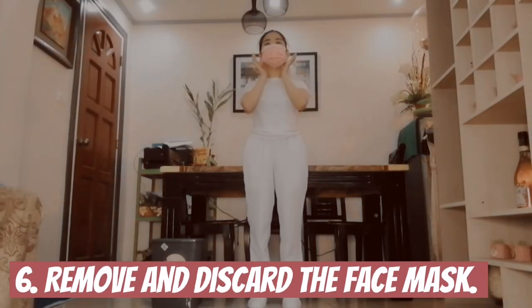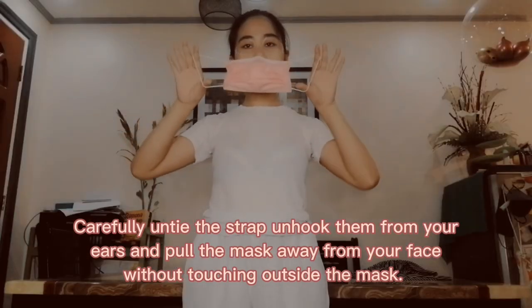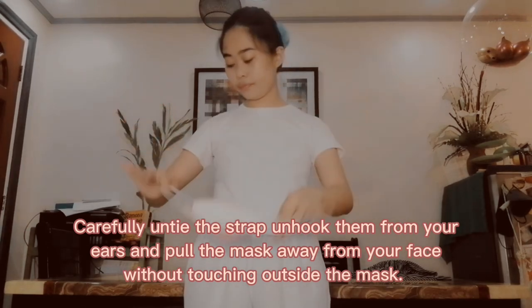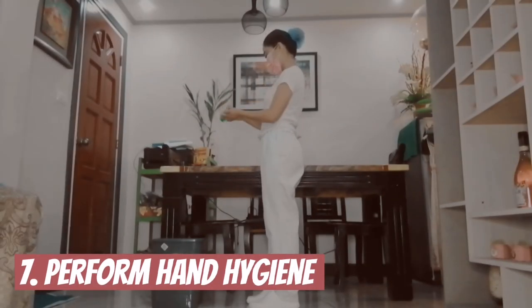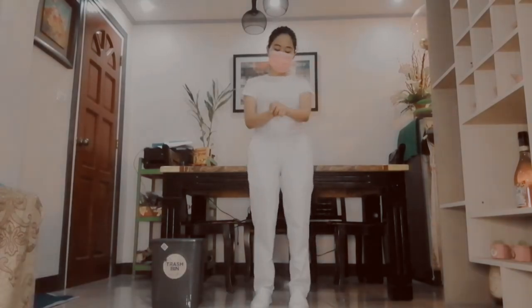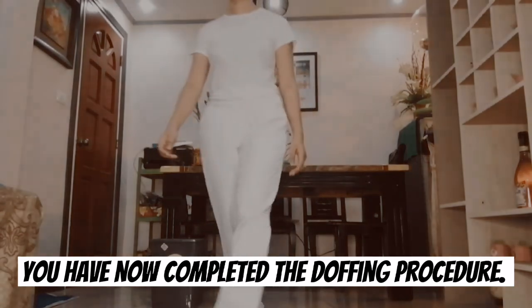Remove and discard the face mask. Carefully untie the straps or unhook them from your ears and pull the mask away from your face without touching the outside of the mask. Lastly, once again, perform hand hygiene after removing the face mask. You have now completed the doffing procedure.